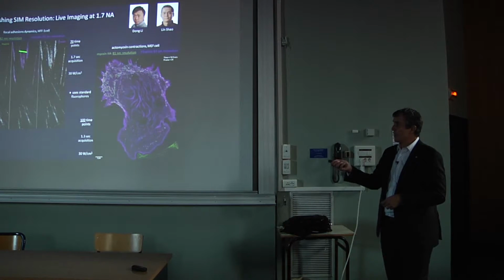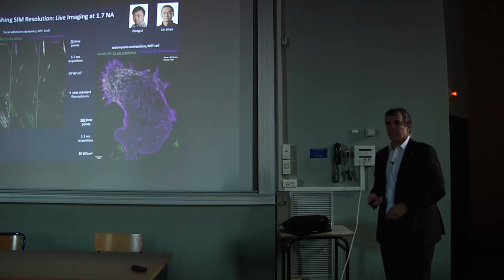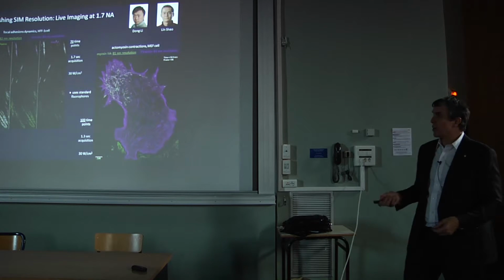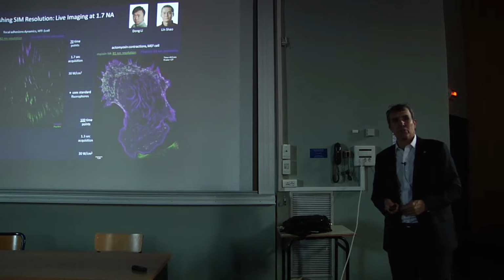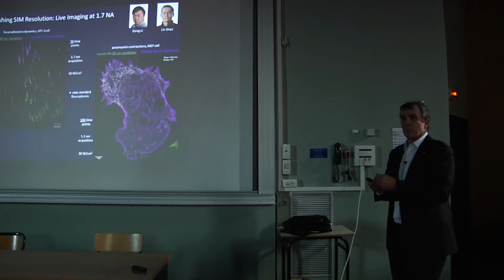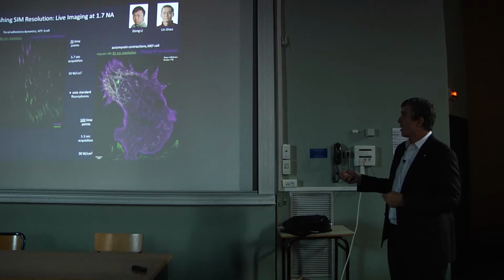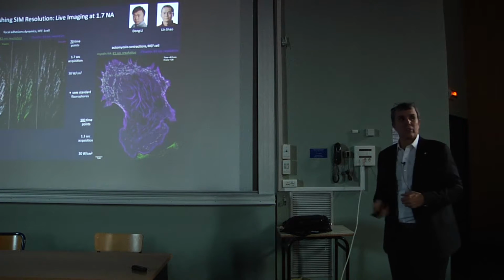So we're using that here. I told you about focal adhesions before. Now you're seeing an example where we're looking at the focal adhesions live and in 2 colors by being able to do the SIM. In this case, you're looking at the myosin 2 again, whose role is to bundle actin filaments together and create these actin-myosin forces to drive the motion of the cell. And you can see at the trailing edge of the cell how these forces are predominant.